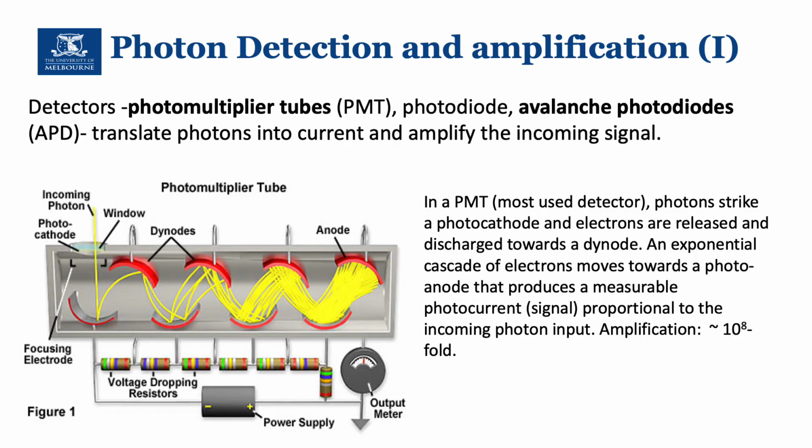So now, once the light has been handled and dissected into spectral components, as I mentioned, depending on the fluorescence that you want to measure and the instrument configuration, you arrive at the photon detectors. And probably the best example of a photon detector that has been in the field for years and years and is still around is the photomultiplier tube. So you need to have a very sensitive kind of detector to handle the dim signals that are coming out of the interrogation point where the laser meets a particle at the flow cell.